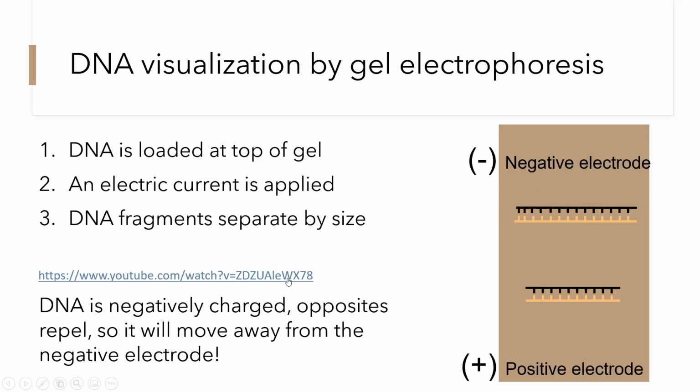This video will detail how gel electrophoresis works. And again, you should pause the lecture at this point to watch this video and answer questions in your video reflection assignment.